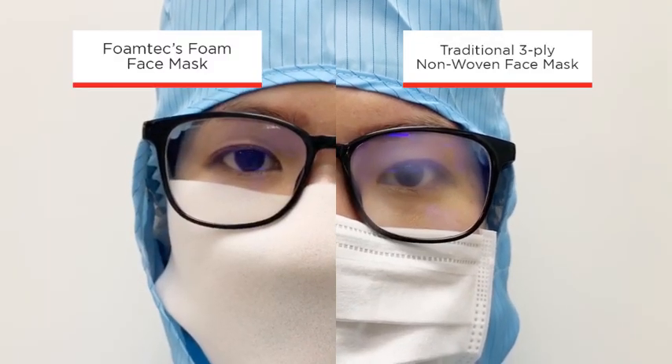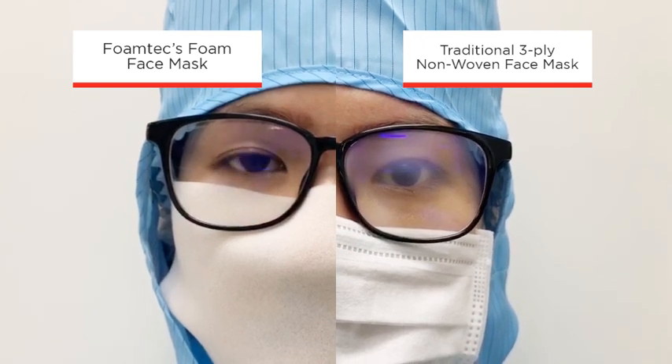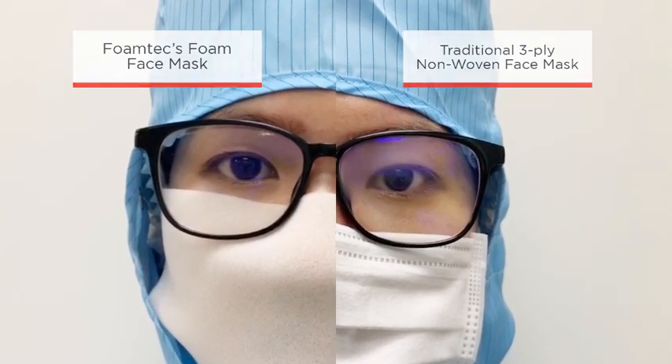On the left, you can see Foamtech's foam face masks do not cause fogging of safety glasses or goggles when compared to the traditional 3-ply nonwoven mask.